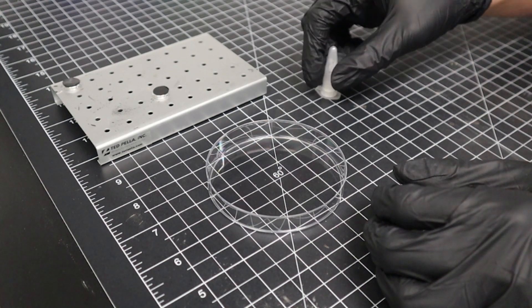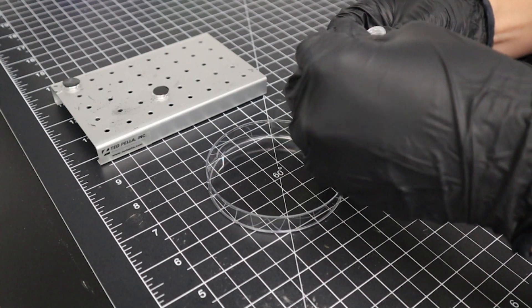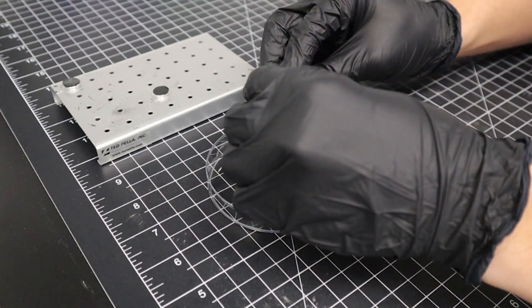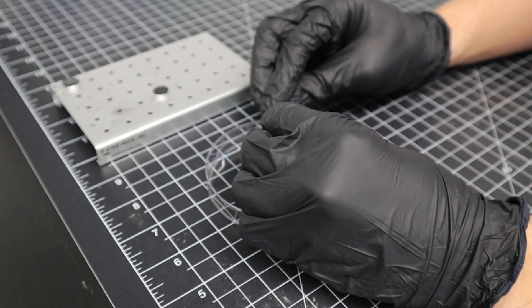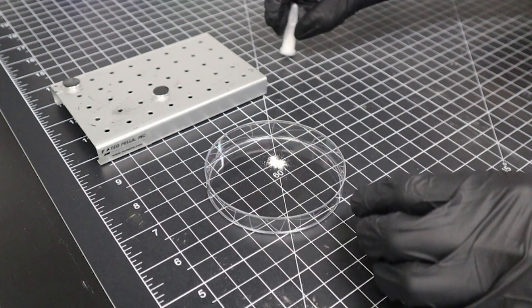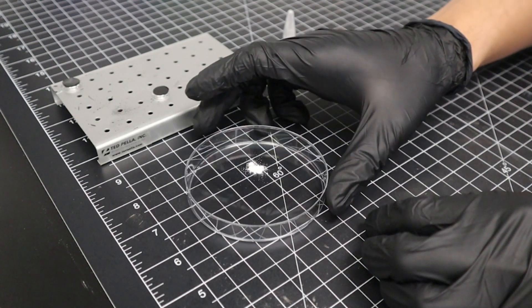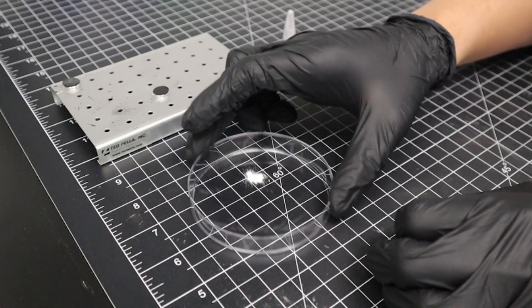We start by emptying some of our powder sample into a petri dish. We can then spread this powder out by gently shaking the dish back and forth or by using a spatula.